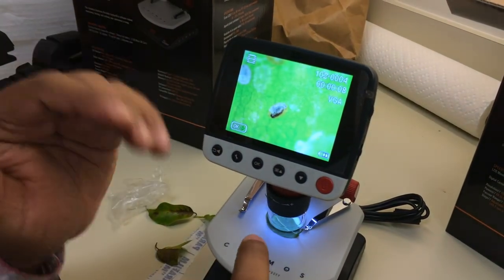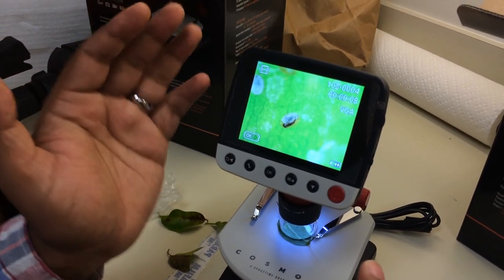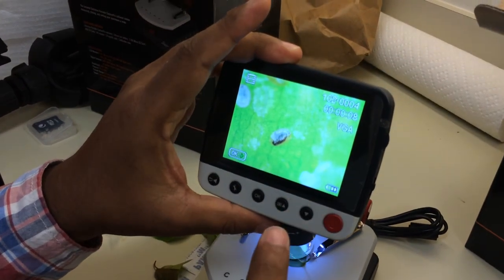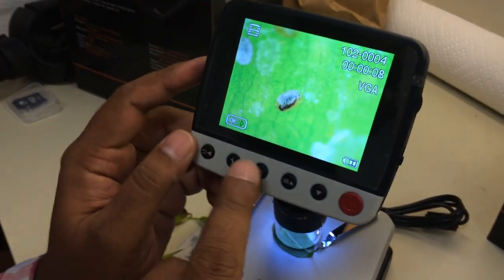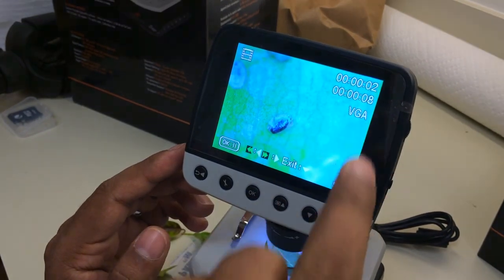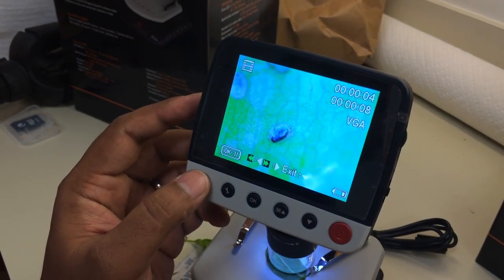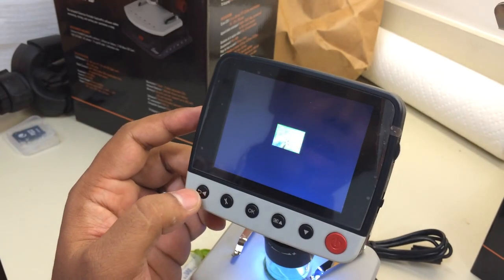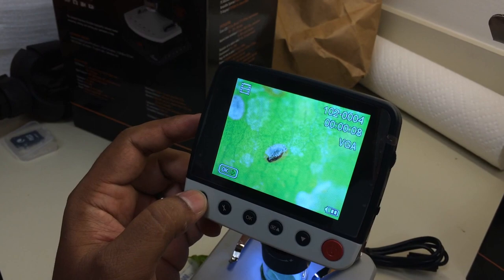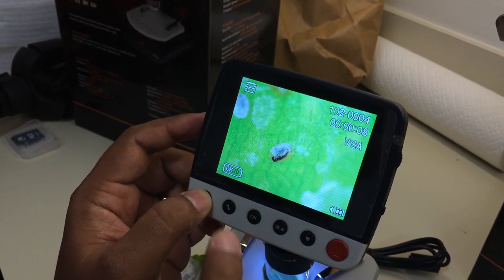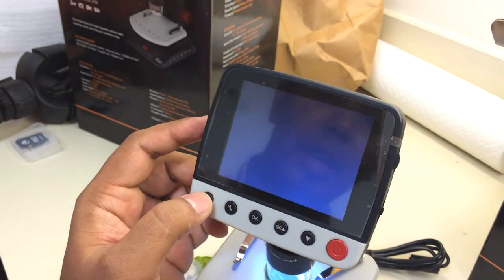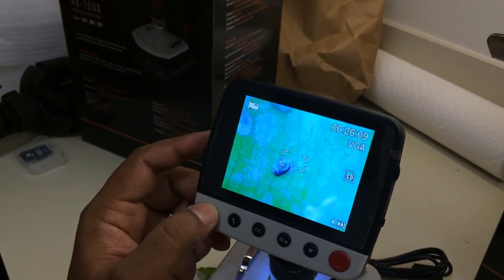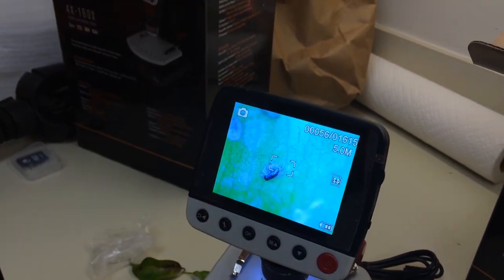If you click one time it will change into still camera mode for pictures, and if you click a second time it will go into video mode. To view a saved video, press OK and the video will start playing. Once finished, click again to go to all saved videos and pictures. Click again to change back into picture mode.